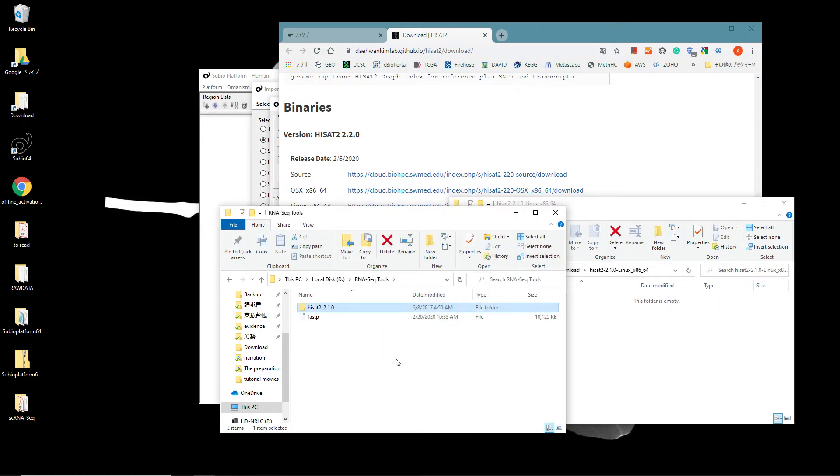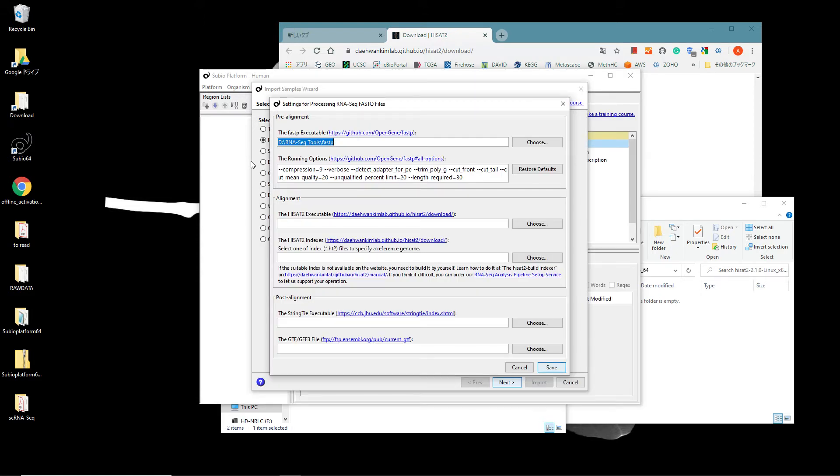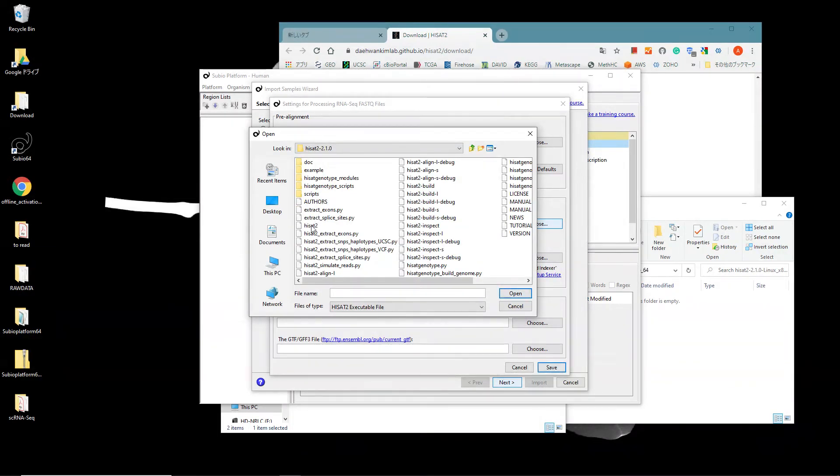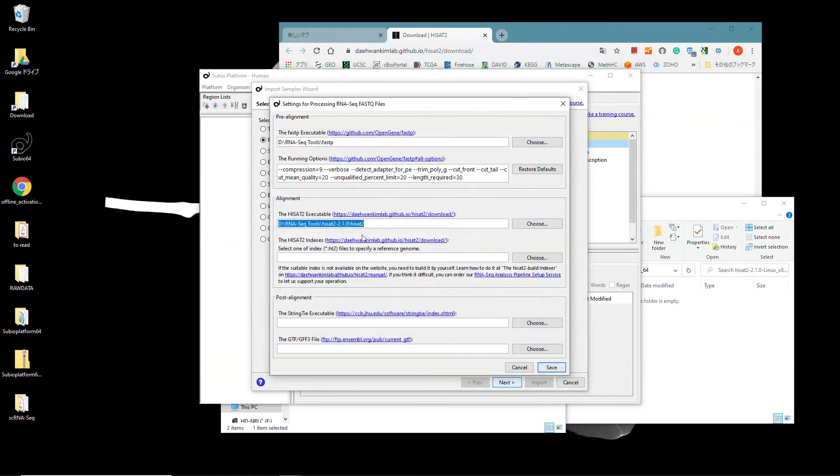Go back to the Subio Platform's setting panel. Click the Choose button at the HISAT2 executable section and select the HISAT2 file.